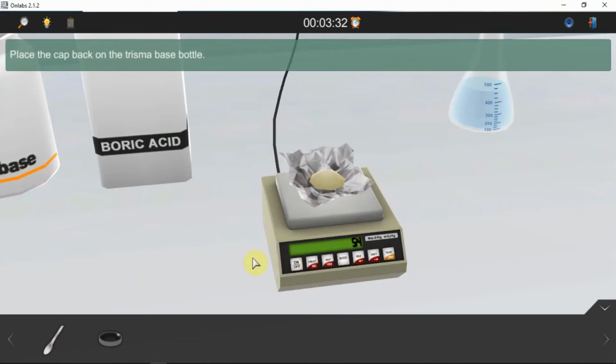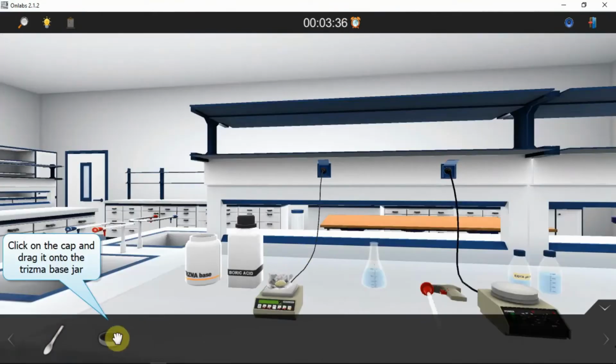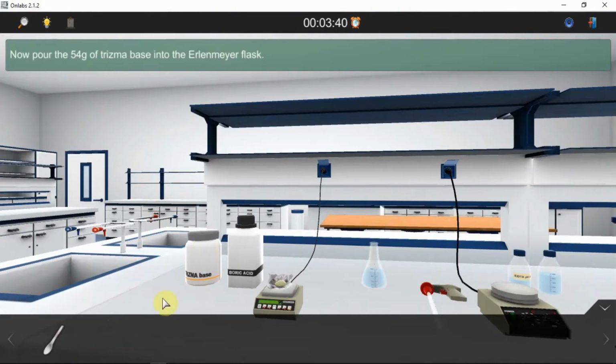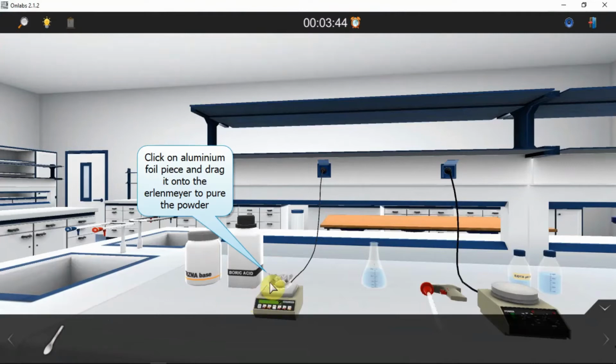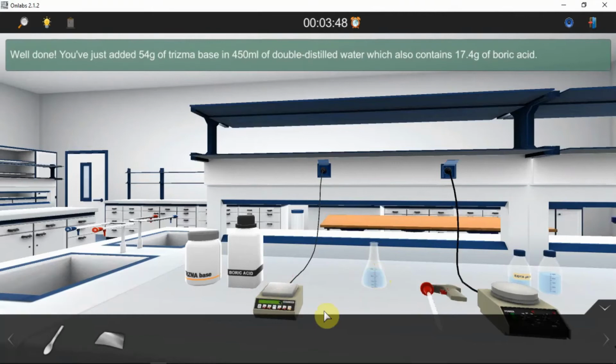Place the cap back on the Trizma base bottle. Well done. Now pour the 54 grams of Trizma base into the Erlenmeyer flask. Well done. You've just added 54 grams of Trizma base in 450 ml of double distilled water, which also contains 17.4 grams of boric acid. Turn off the electronic scale.